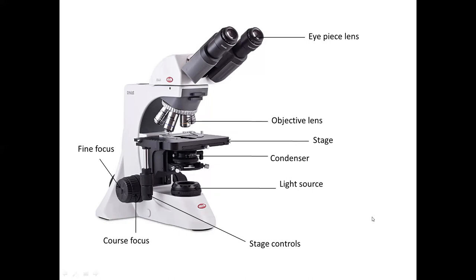Now, let's revise the parts of the microscope. Here you have the eyepiece. This is a binocular microscope, so there are two eyepieces where you place both eyes and focus. That is attached to the base and stand of the microscope. Underneath the eyepiece lenses, you get what is called the nosepiece.